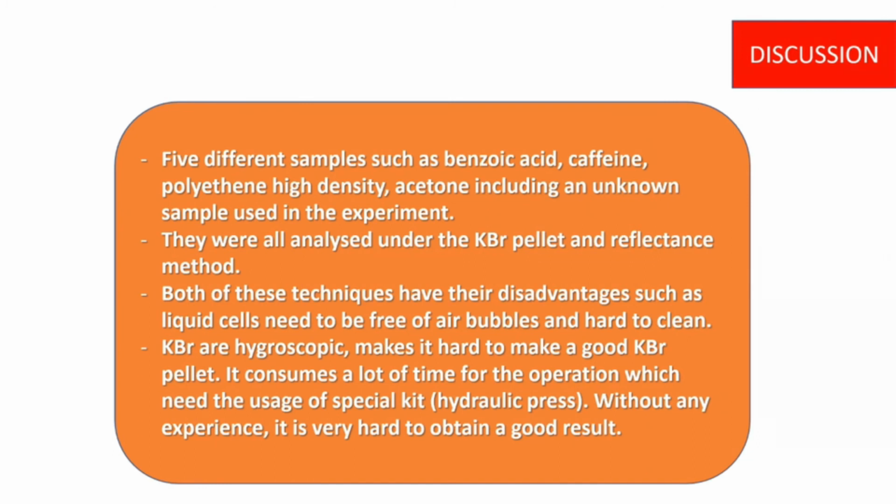Next, the KBr, which is potassium bromide, is hygroscopic, which makes it very hard for us to handle or store. It is hard to make a good KBr pellet without any experience, and this is the first time we used it in an experiment.